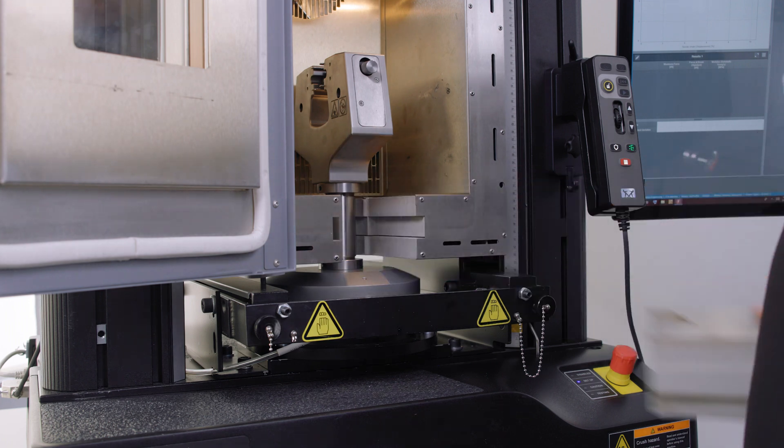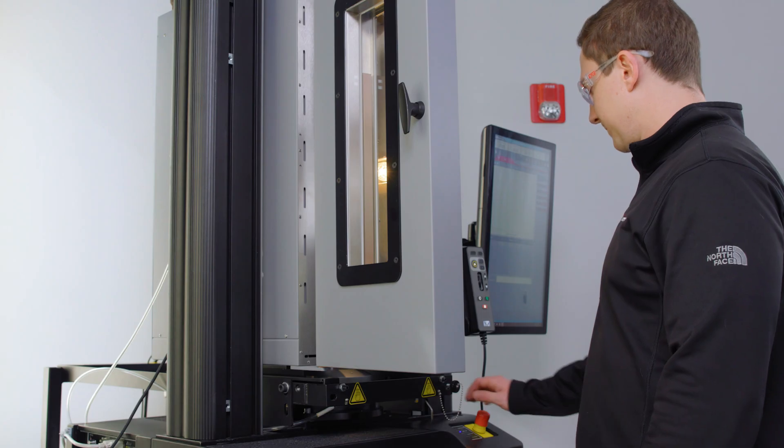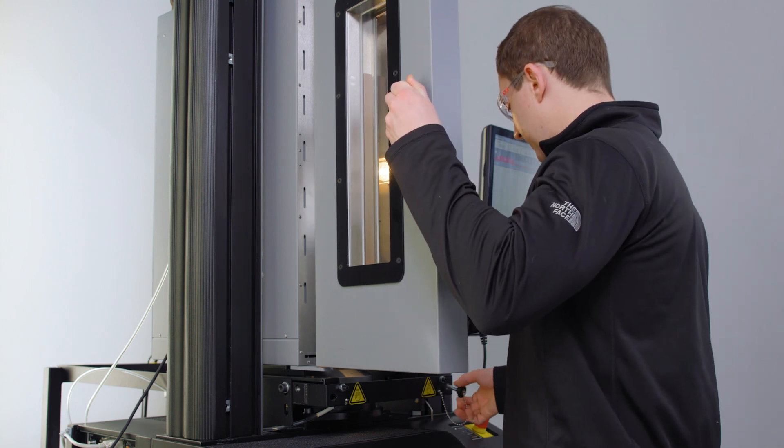Moving the chamber is easy. These wedges are removable to allow the chamber to be moved without having to dismantle the load string. After removing the wedges, you simply slide the chamber out of the way.